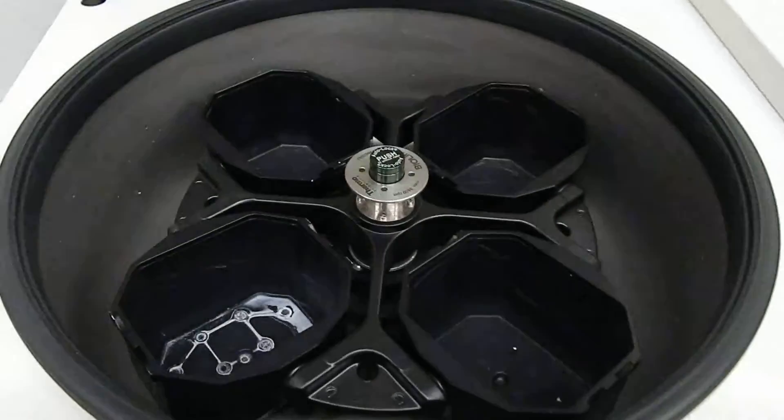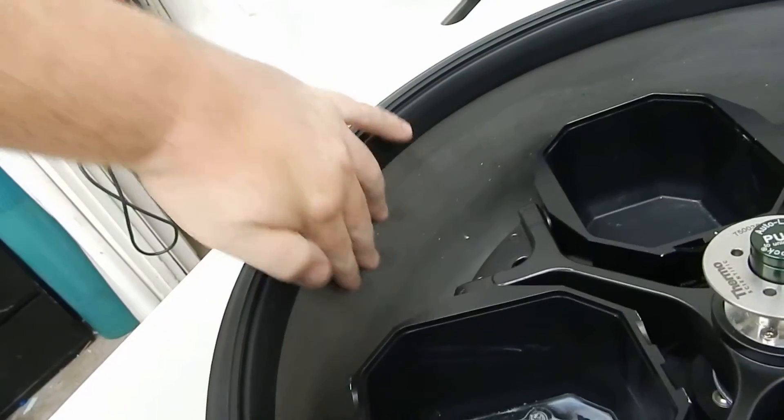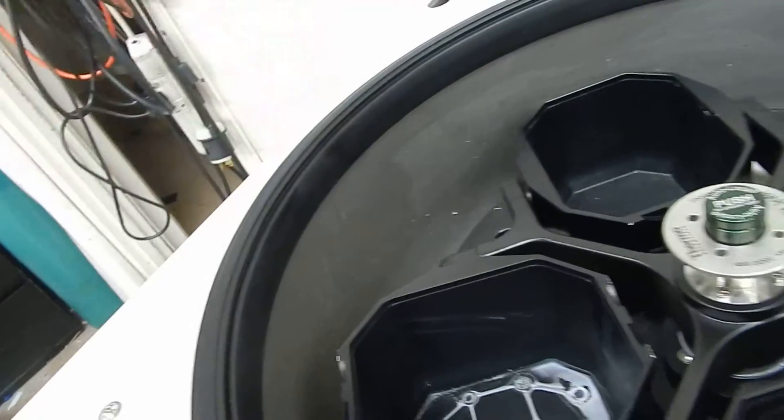Opening the lid — the rotor is stopped. And as you can see from the ice forming on the walls, it is in fact getting cold.